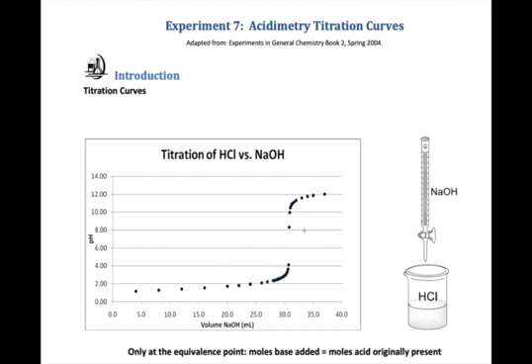That reviews the concepts that are going on with this experiment. Titration is quite flexible. We could have a well-known amount of HCl in the beaker, with both volume and concentration, and a less precisely known titrant, and we can again find an endpoint and deduce something about the titrant.